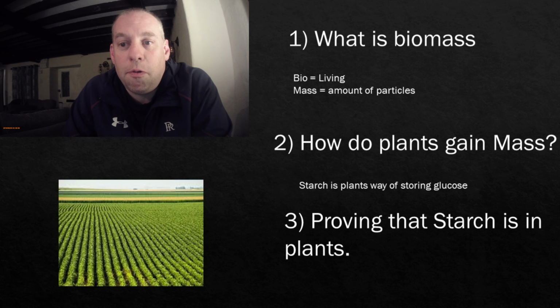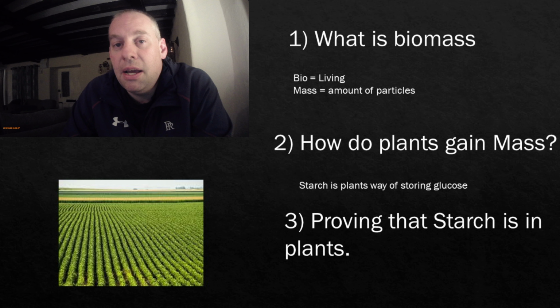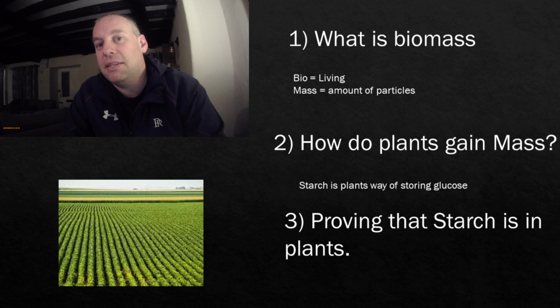So what we want to do first of all is to prove that starch is in plants, and we're going to look at testing a leaf for starch. So I'm going to transfer you over to the lab in a second where Mr. Kipax is going to show you how to test a leaf for starch. I want you to watch him carefully because afterwards I'm going to be asking you to write down with diagrams the different stages that he does. I'll also be asking you questions about how he approaches this experiment. So, off we go to the lab. Let's go see Mr. Kipax in action.